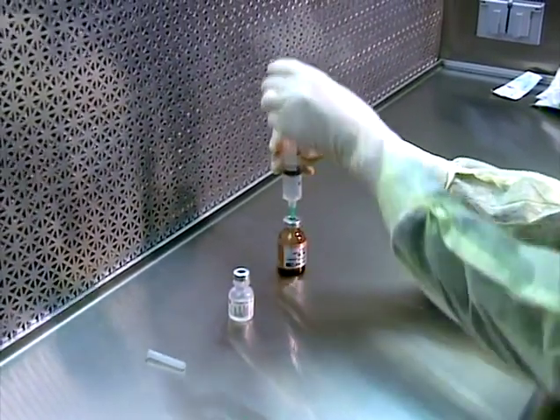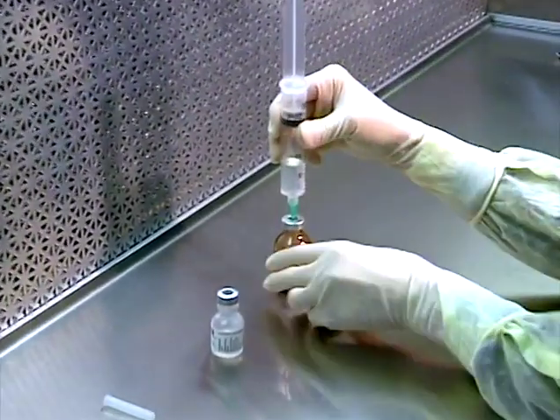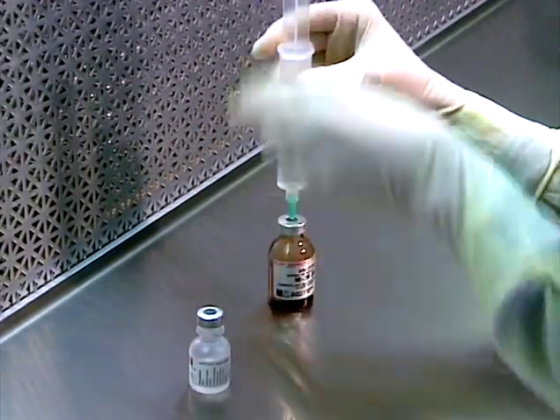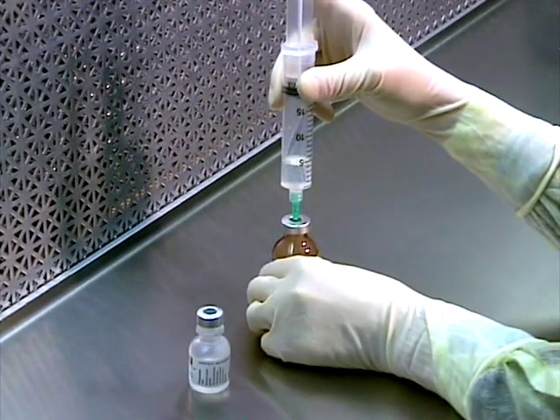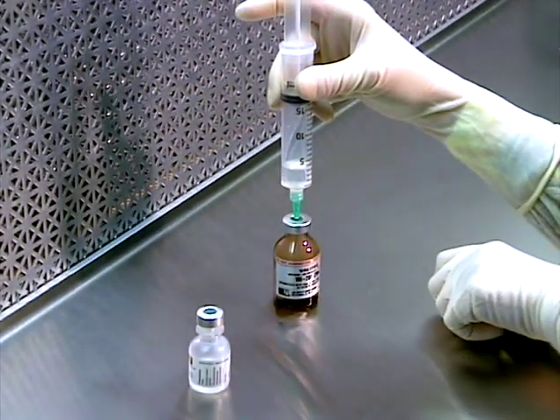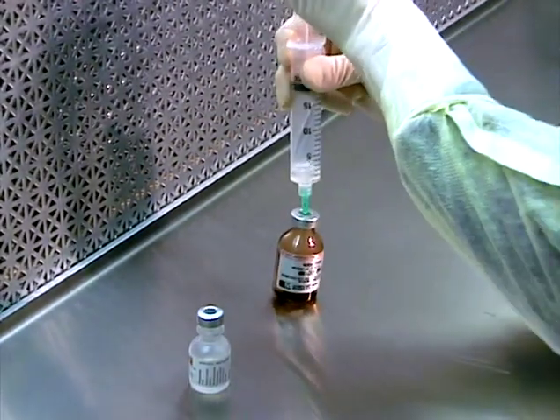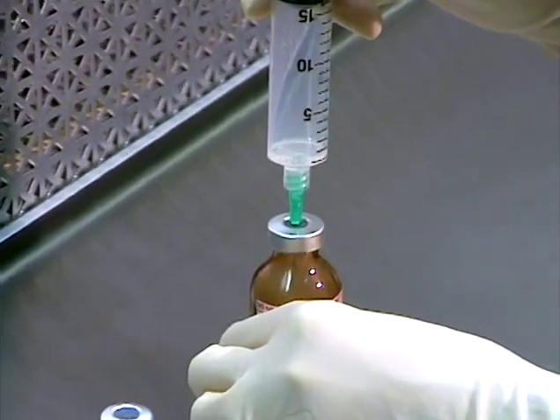past the stop. This creates negative pressure in the vial. For vials which already contain a vacuum, this step is not required. Remember, avoid pushing on the plunger against pressure when compounding with a vial. Allow the diluent to flow into the vial until the pressure is neutral, and in a seesaw fashion, repeat the procedure until all the fluid has been transferred into the vial.